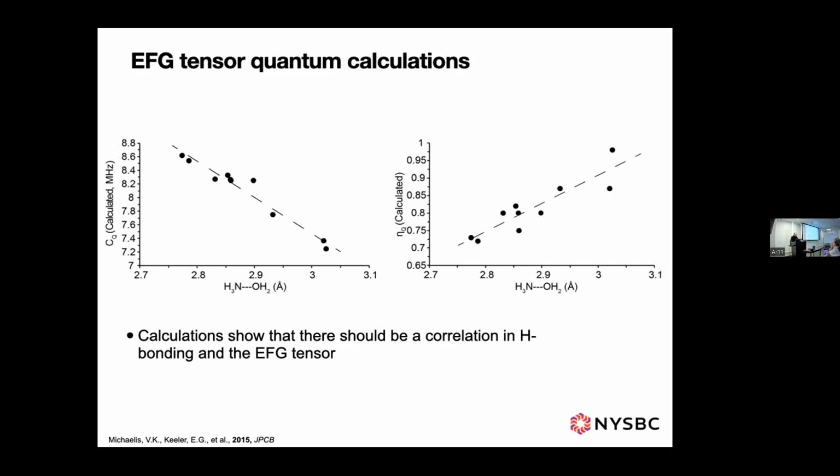But the thought, from our perspective, is that these waters undergo multiple different motions that are causing averaging in the hydrogen bonding. So in a moment in time, when you do a 77K or 4K neutron structure, you see a hydrogen bond that's there.